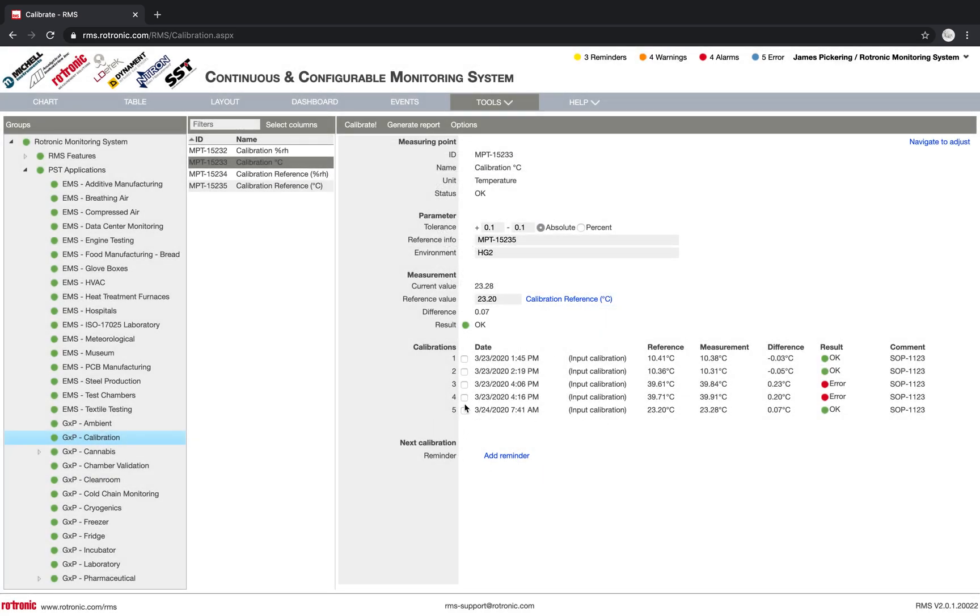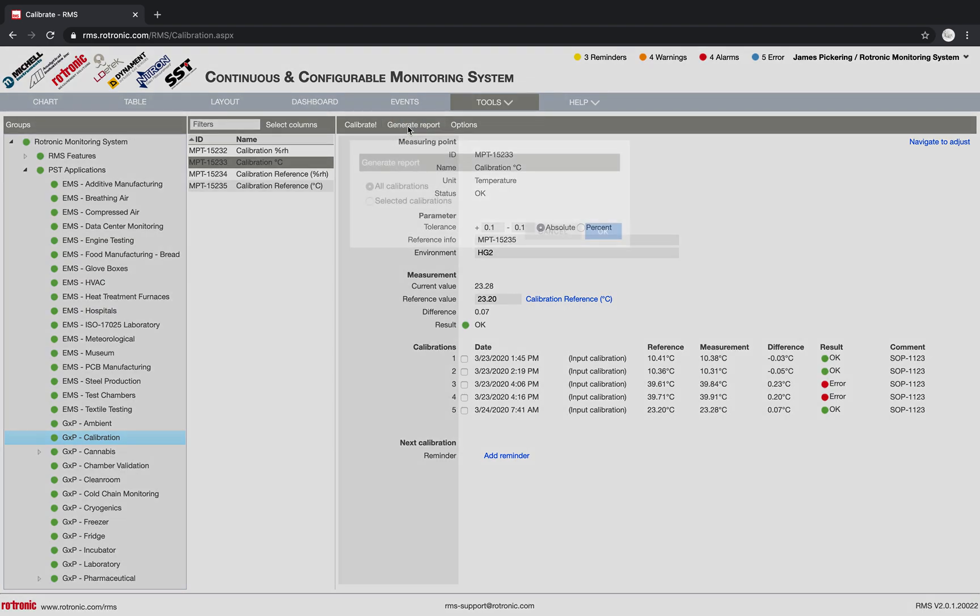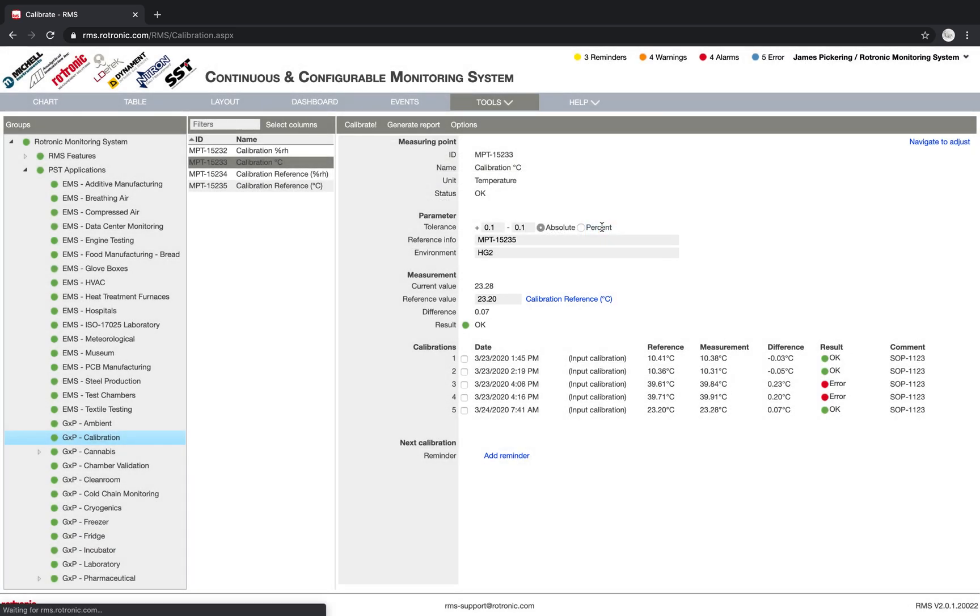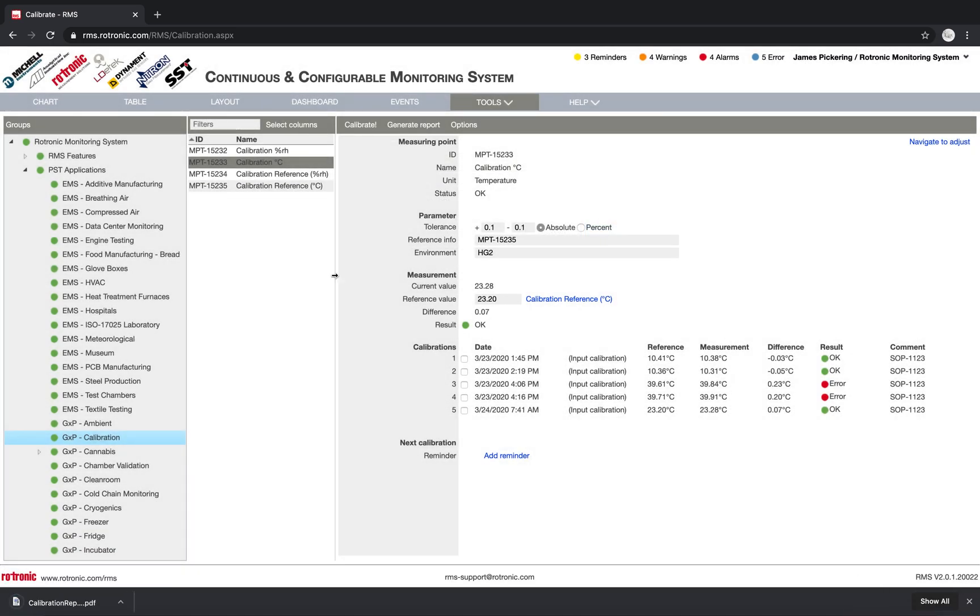What I can do now is I can generate a report. If I click on generate report, it'll ask me, what do you want to see? All calibrations or selected calibrations. For example, here I click on all calibrations. I click on okay, and then down below a PDF will open up.